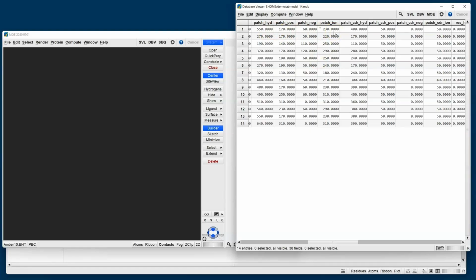The variants that were tested generally had better chromatographic behavior, and we can see here that the hydrophobic patches near the CDRs tend to match these experiments, where the mutants that had lower HIC retention times also have lower hydrophobic patch areas. So what we're going to do next is load in the wild type and one of these candidates that has the lowest hydrophobic patch area, and we'll analyze these hydrophobic patches in 3D to see if we can explain their differences.